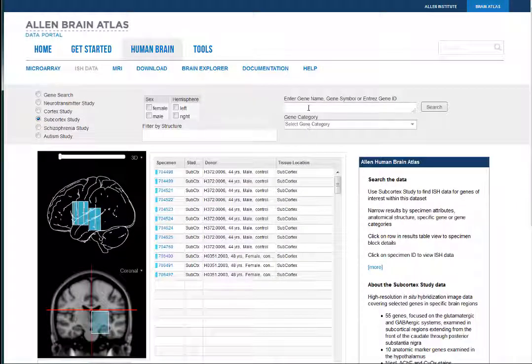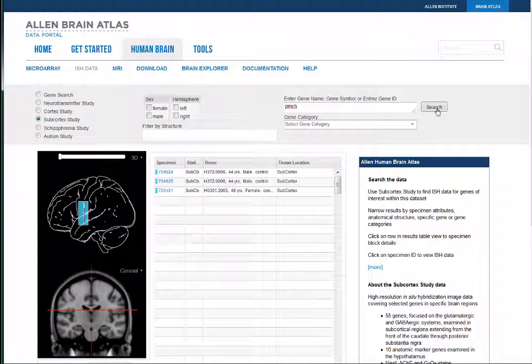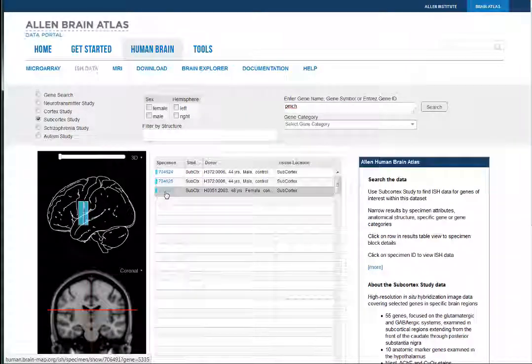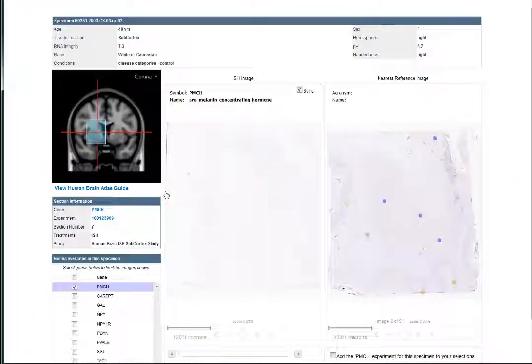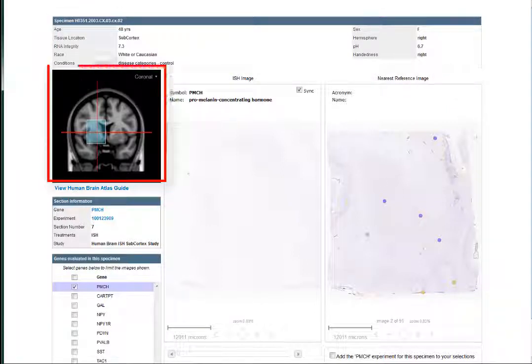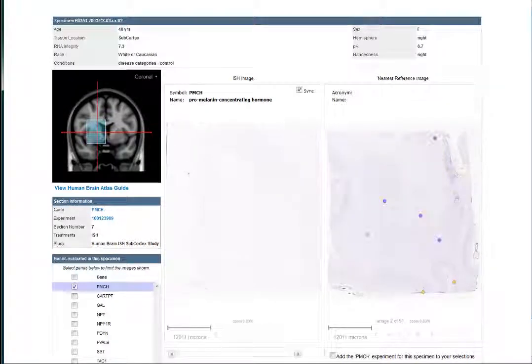Once you've found a gene to inspect, click on the experiment ID, and you'll be taken to a page with similar features. Metadata, a preview of the general area, and a list of the data from this specimen.